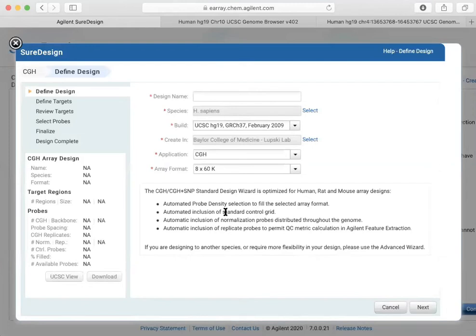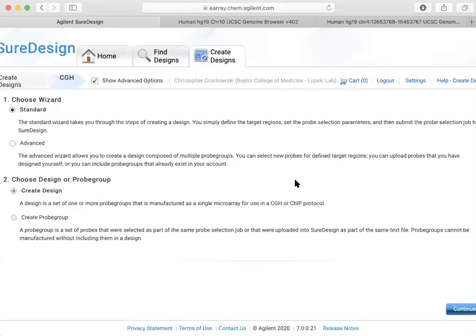Do you have any questions? Yes, after the order and this order number, how does it work? Are we going to order in here, or forward this order to Margie? So I'll send you the email of our Agilent rep.